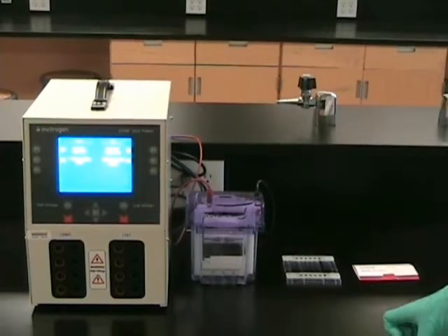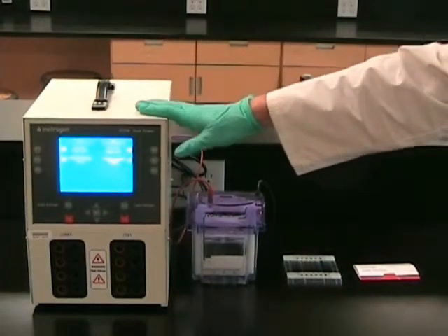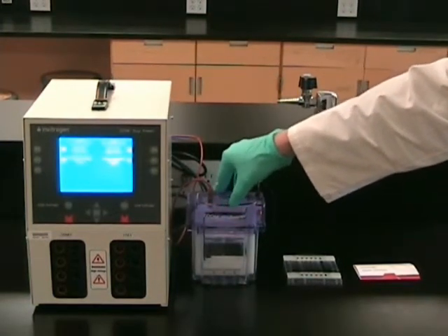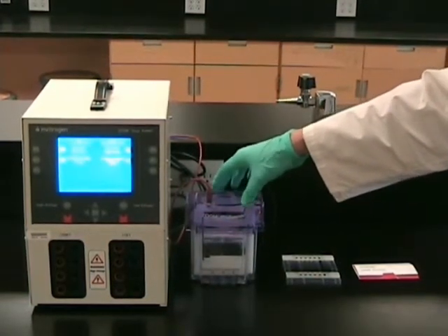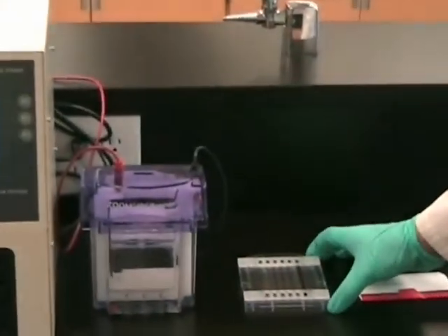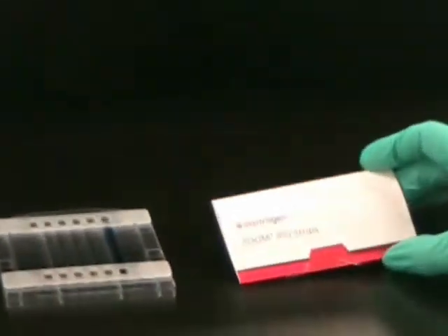First, we're going to focus on the first dimension. Here we have a power supply. This is the Zoom IPG runner system from Invitrogen, which we'll use in our electrophoresis. Here we have a plastic cassette where we'll load our strips, and finally we have the IPG strips.